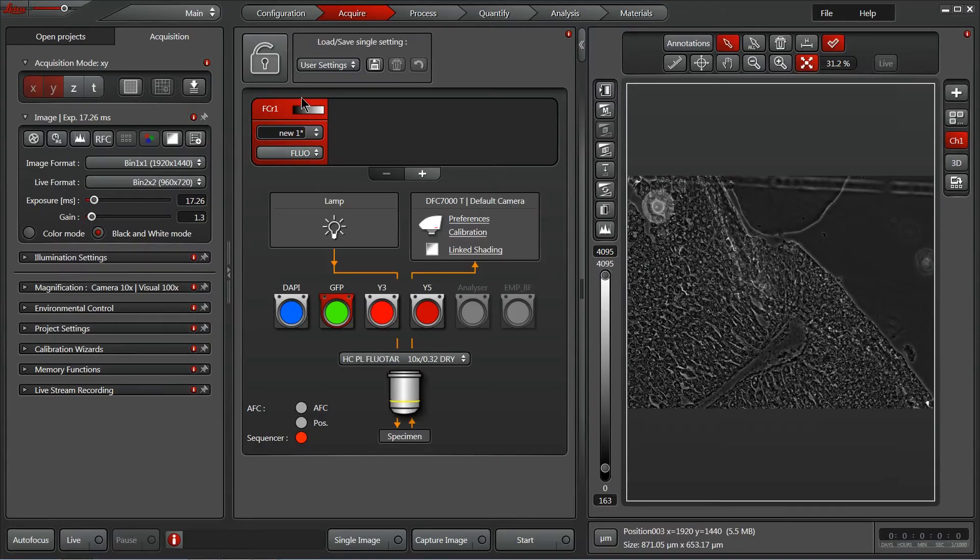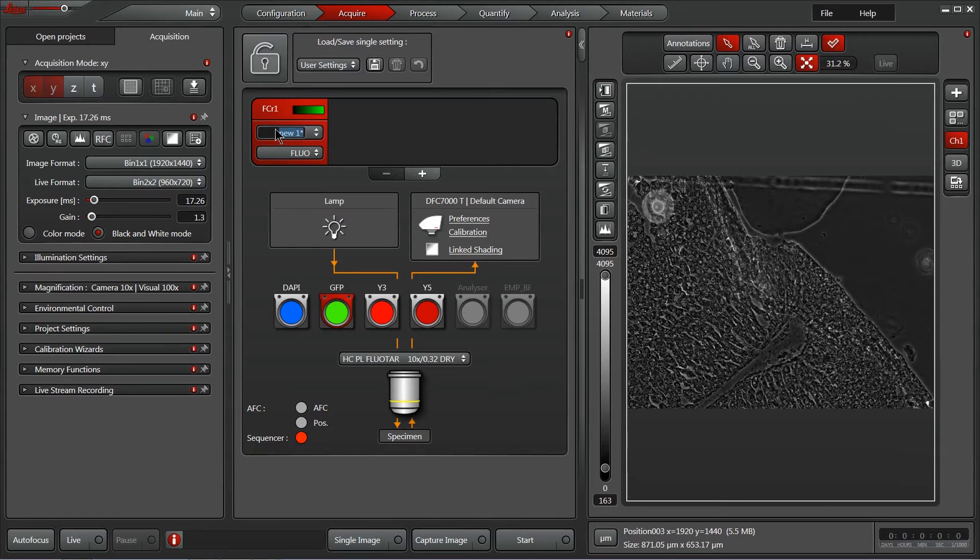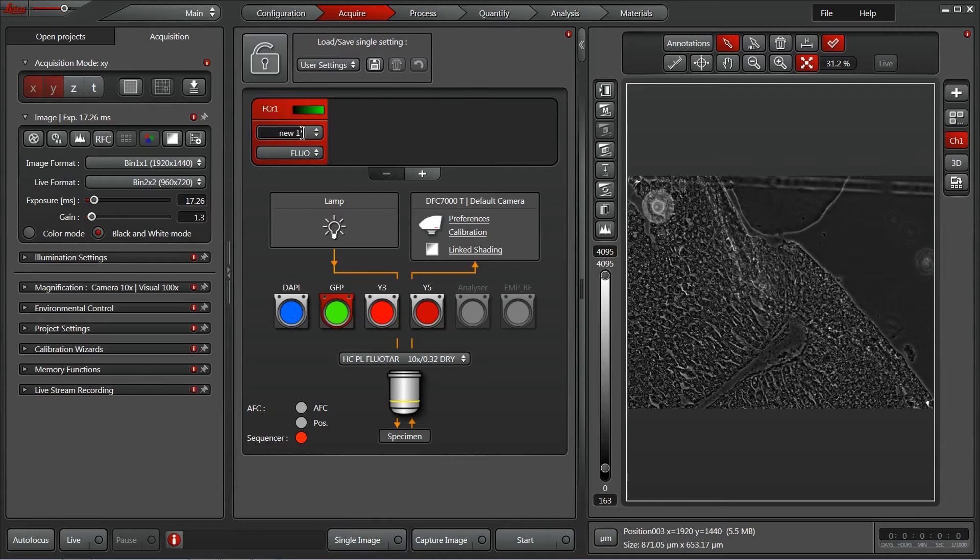So for me, I'm going to go ahead and change that to green. Now we can also type in a name of our probe or protein, whatever's most useful, since the metadata will also include the cube name. It might be redundant to say GFP here, so instead I'm going to type in tubulin for this channel.